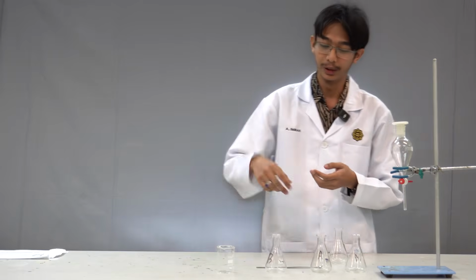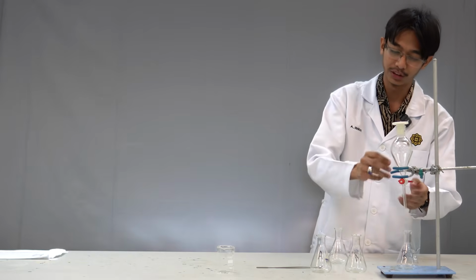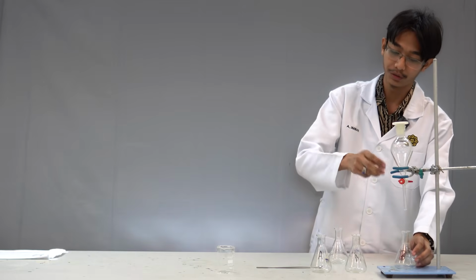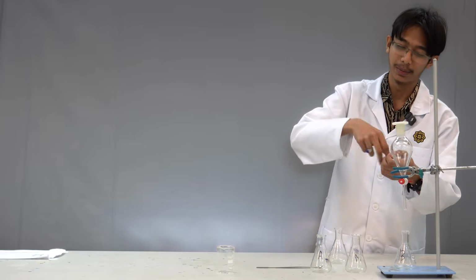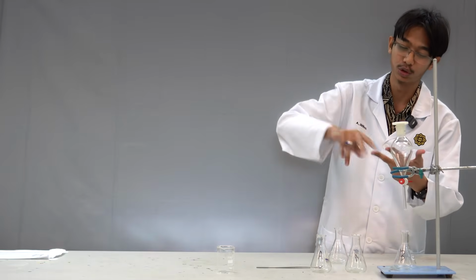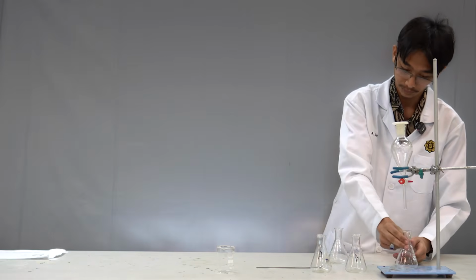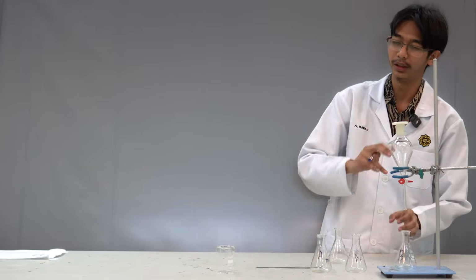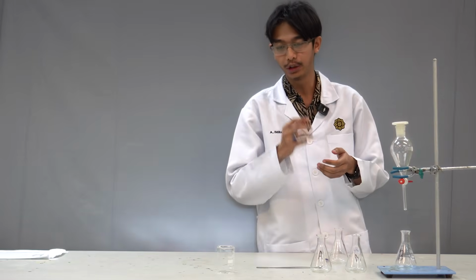Utilizing this property, we can differentiate and extract the acid from our liquid mixture, because this mixture is going to have base, acid, neutral. We only want the acid. We are only concerned with acid at this moment. So how do we make sure that acid comes out?